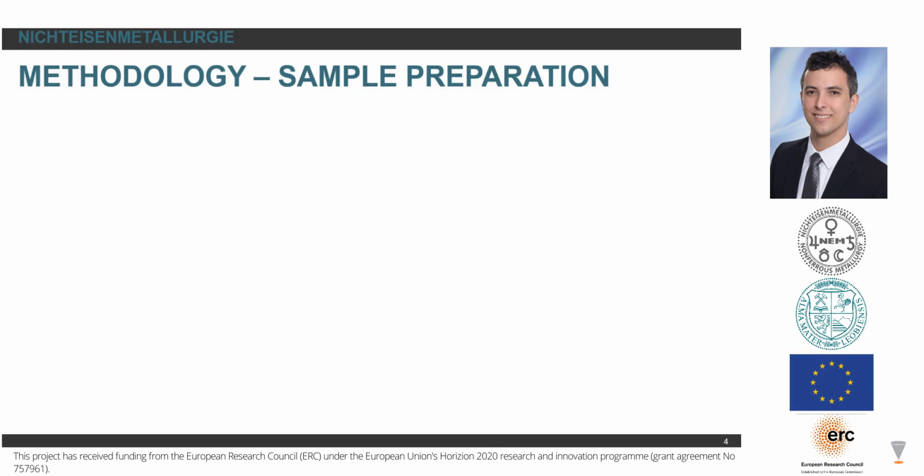material together. So to start, in our case we have an aluminium electropolished sample, which we manually section with the help of a scalpel. And then after that, we separate a really small area here, around 50 micrometers, and we transfer it to a chip.